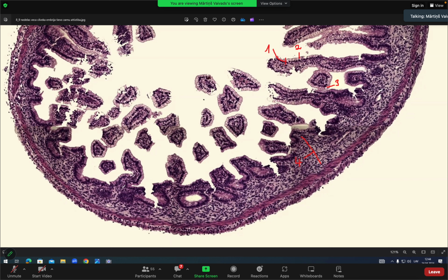Then also, I mentioned briefly, you still have intestinal villi. So number 5, intestinal villus, or developing intestinal villus. So you see intestinal villi. You also see fragments inside the lumen. These are still intestinal villi, just smaller fragments that are inside the lumen. So intestinal villus. What else?